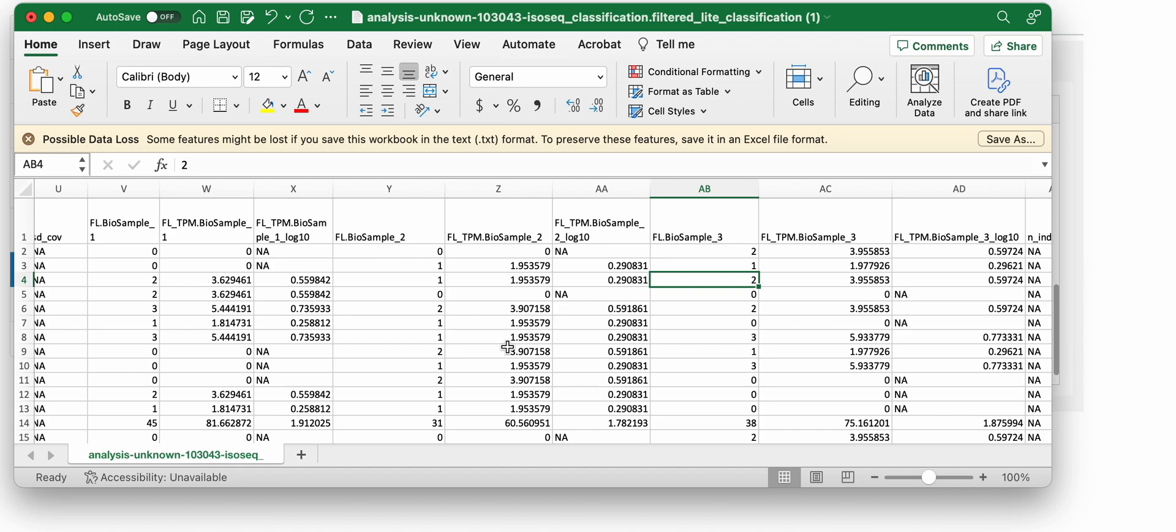That's the difference. If you run pooled, you'll get one final classification file and per sample counts in that file. If you run cluster reads separately, you're going to get one file of each for these and each of them will only list the per sample count for that sample. That is the demo for read segmentation and ISOC workflow.